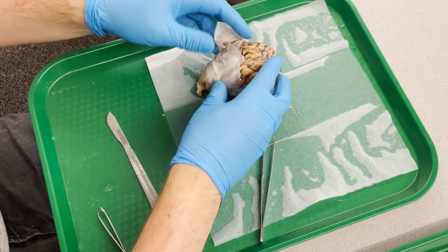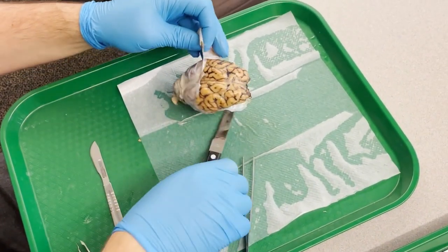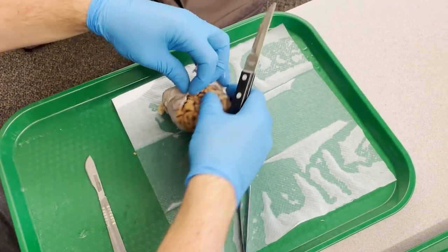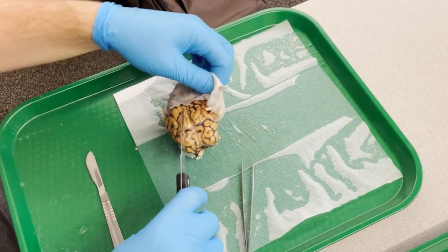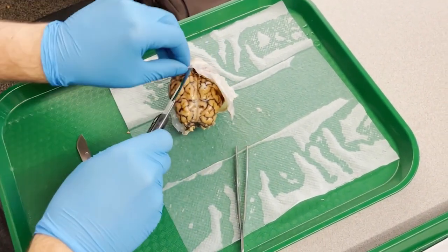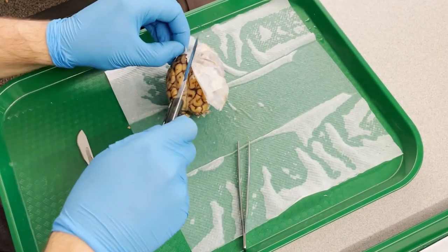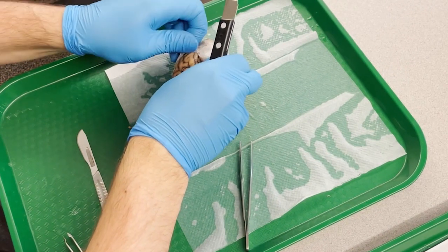All right, so as we peel it back, it's gonna get a bit tricky. So I'm gonna continue to slice up and outward. You wanna make sure not to poke your hand or anything like that. But as you're peeling it back, you wanna make sure to peel it back from between the two hemispheres as well, cutting carefully. It is tough. You can actually hear me tearing through it.